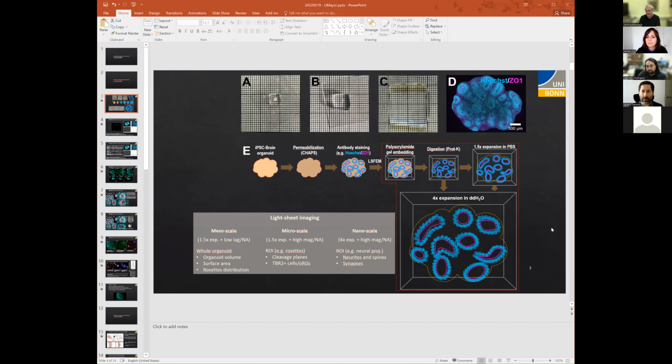I think this is like in normal microscopy also. You will sooner or later get problems with light scattering in your sample, but you can look at live organoids during their development with light sheet microscopy. It will definitely work better than confocal microscopy, because the illumination is more benign. Photobleaching is reduced and everything. So it's certainly an excellent technique for that. We never tried it though, because our collaborators do the organoids and we do the imaging here in our lab.